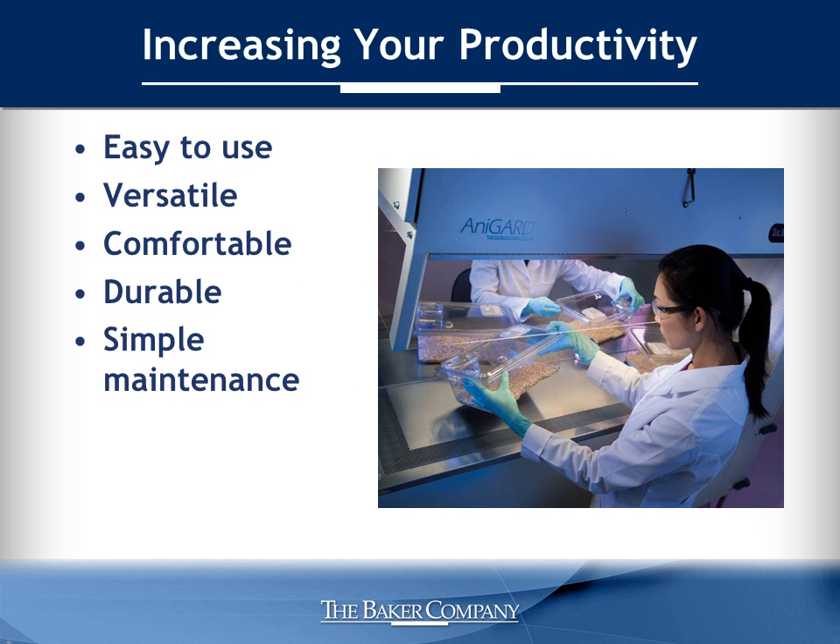Now let's explore some of the features that will make the AniGuard E3 your new favorite. This animal transfer station was designed with you in mind. It's easy to use, versatile, comfortable, durable, and simple to clean and maintain — all of which combine to make your lab more productive.